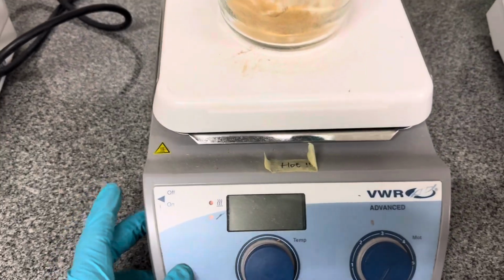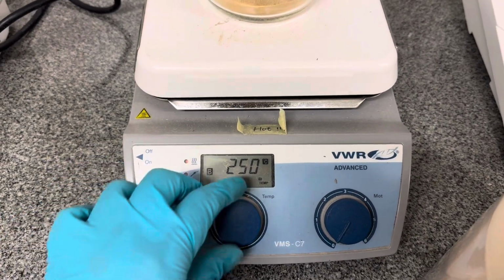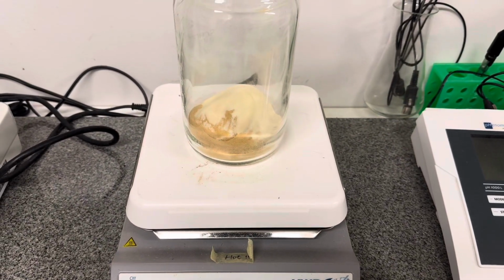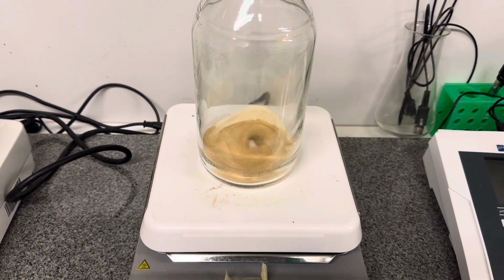I just turn on the machine. Okay, so now it is at 0. If I increase it, probably you will see the movement inside. Yes, you can see that the magnetic bar is moving.